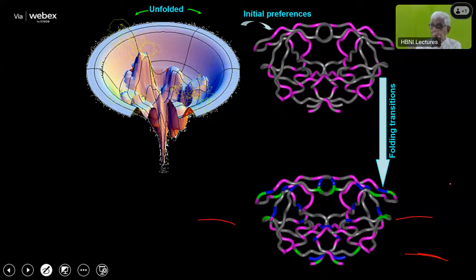Yes. And there is a symmetry here. These two are identical. Then you will see only one set of peaks, because the two monomers are identical. So that means you are actually making two tertiary structures together. Dimer is getting formed. So the whole system is happening together.